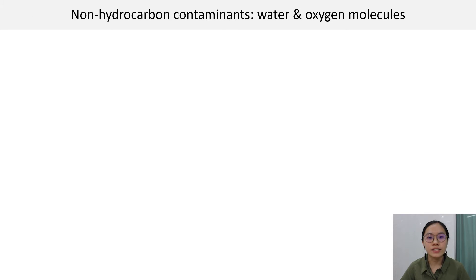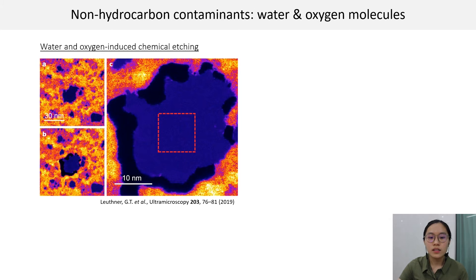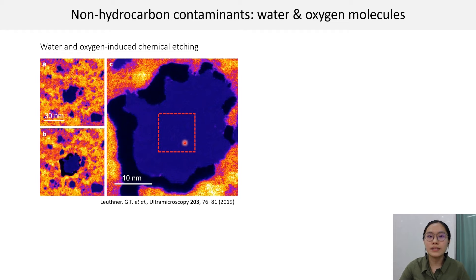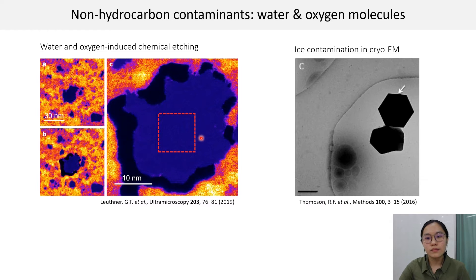We also need to concern ourselves with non-hydrocarbon contaminants such as water and oxygen molecules. Leuthner et al. provided images here showing that radicals derived from water and oxygen molecules can cause lattice damage by chemically etching the specimen, as shown by the dark region here surrounding blue-coloured pristine lattice. This process is often mistaken as knock-on damage, when it is actually a chemically-assisted process. In cryo-electron microscopy, we have excessive moisture that can form crystalline ice and diffract electrons, which also compromises the structural integrity of our specimen.